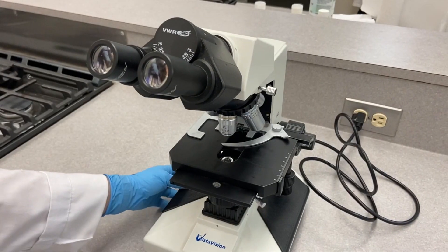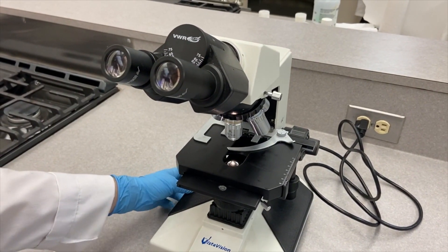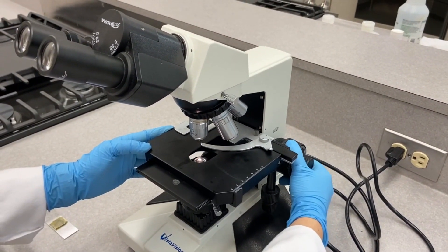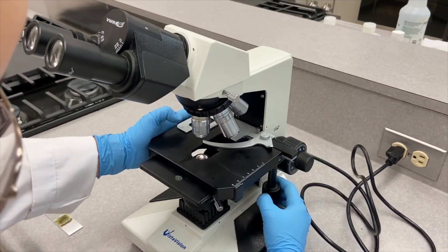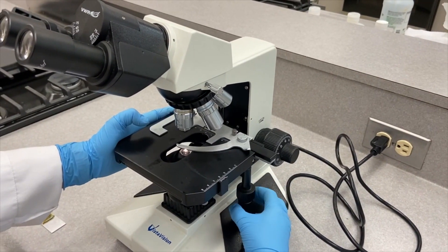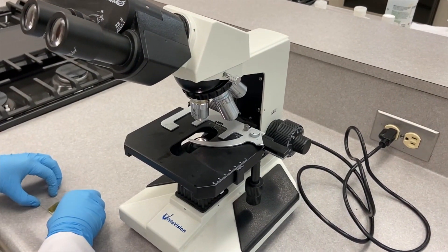Now we start by turning on the microscope, turning on the light, and pushing the stage up a little bit and forward. Then we replace our slide on the stage.